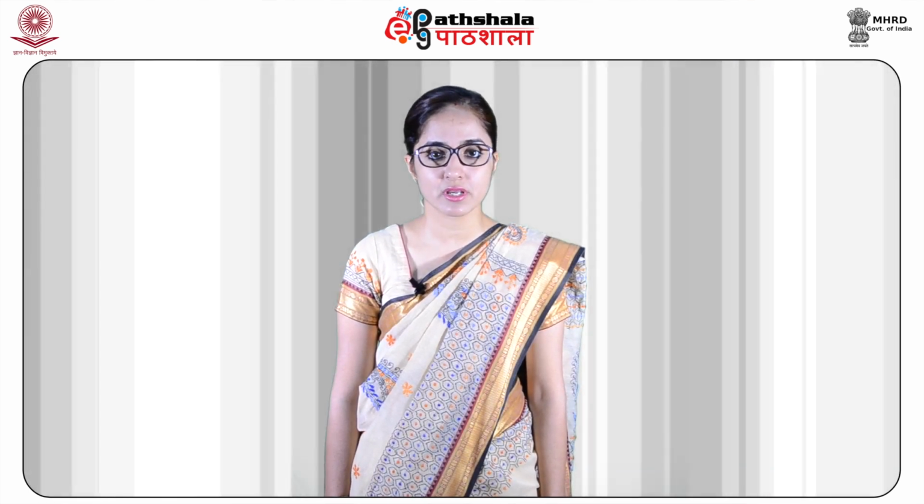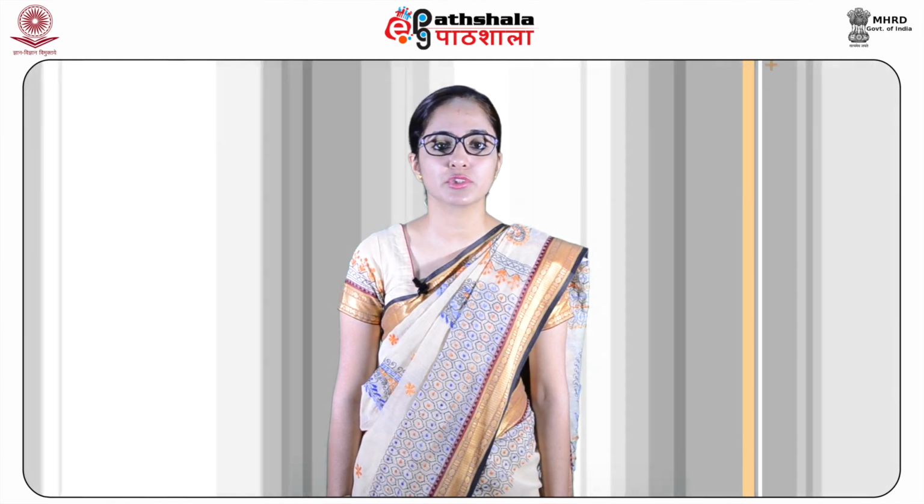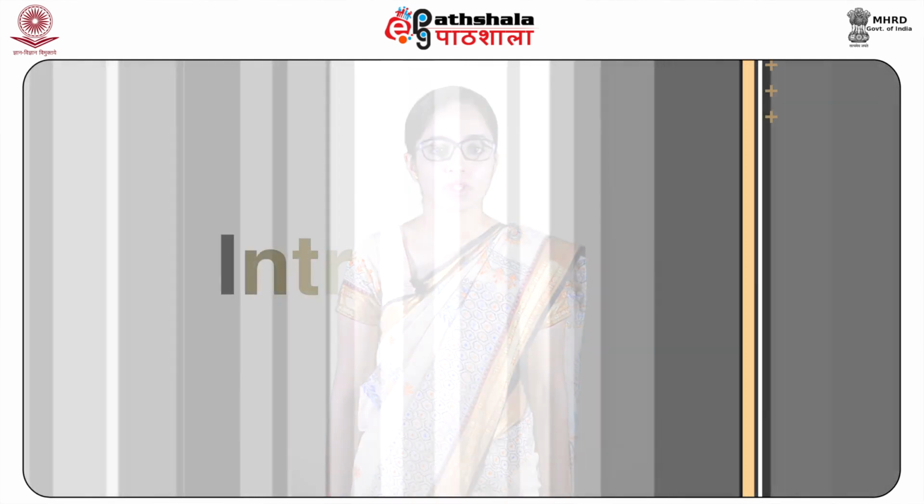And we will also discuss some of the problems related to NMR structural elucidation.